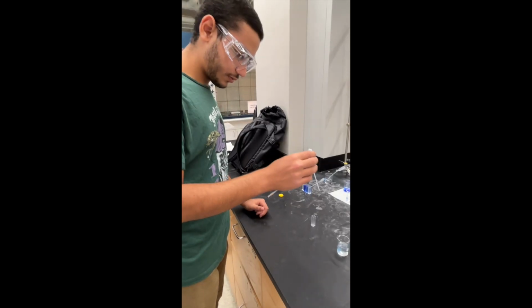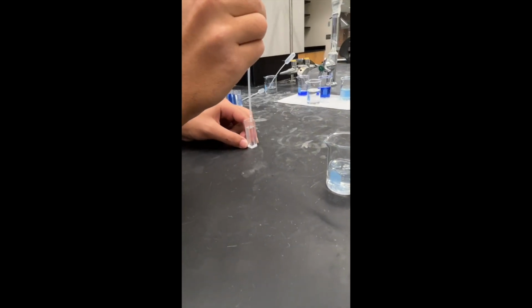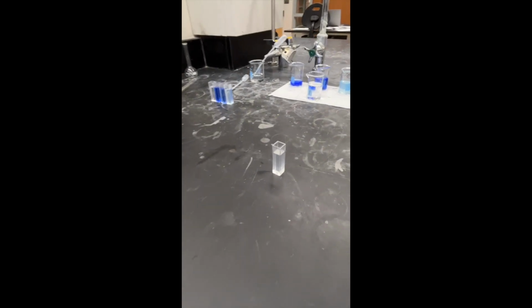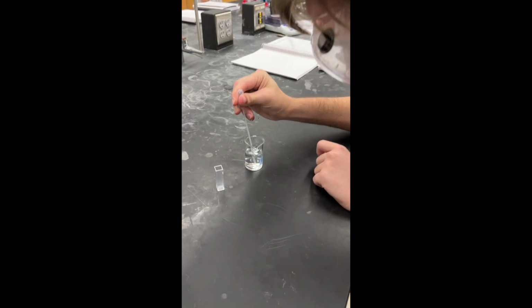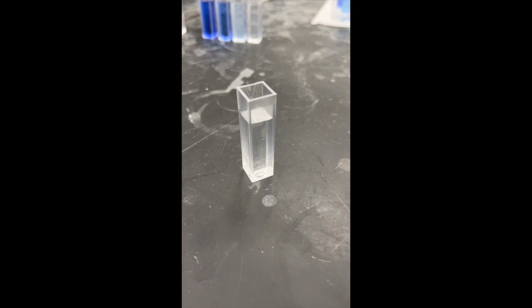There are a total of 6 cuvettes. The first cuvette will be filled with water. It is the blank cuvette. The second will be filled with the original stock solution. The last 4 cuvettes will be filled with each of the diluted solutions. This is the blank cuvette filled with water.